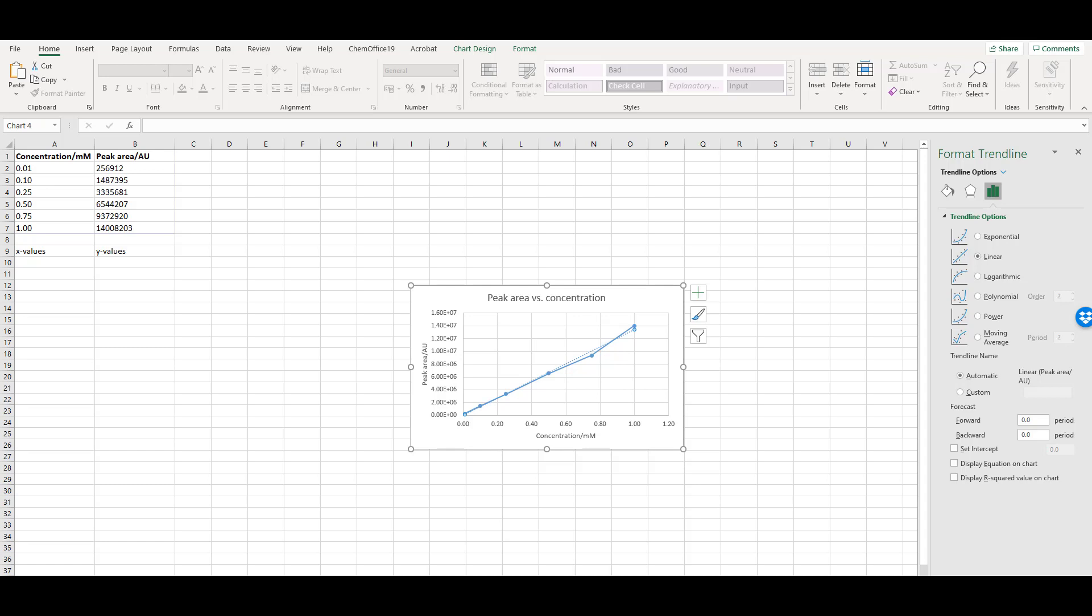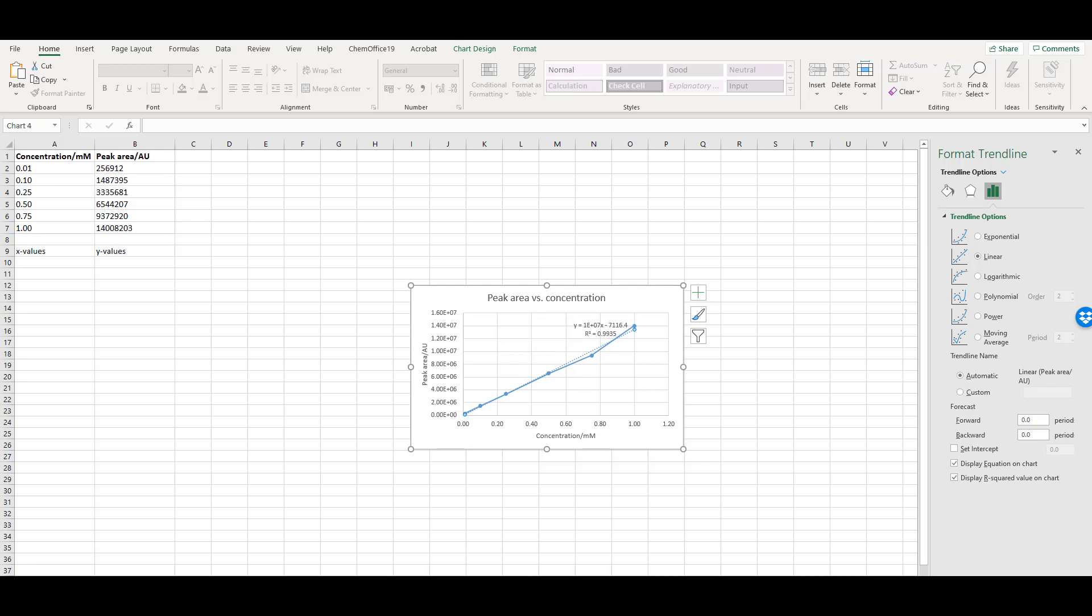A panel appears where you can specify the type of trendline you want to fit to your data. In most calibrations, this will be linear. Check the display equation on chart and display R-squared value on chart options. You'll need the linear regression equation to calculate the concentration of any unknown samples, and the R-squared value gives an indication of how well your data points fit the trendline.